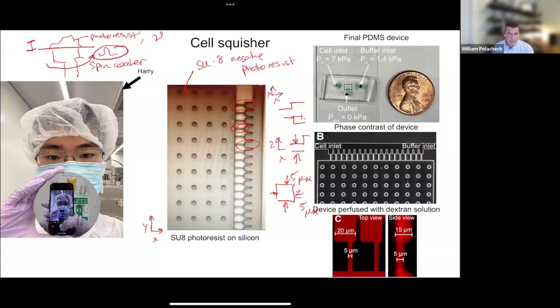So when you buy photoresist, they have these big tables or charts that show you spin your wafer at this rate and you end up with photoresist at that thickness. If any of you have been in the clean room, you know those tables are meaningless. You have to repeat them yourself, but either way, there is some relationship between the spin rate and the resulting thickness.